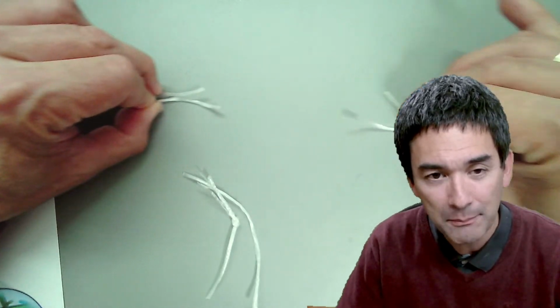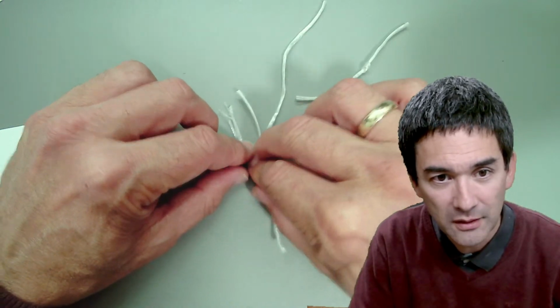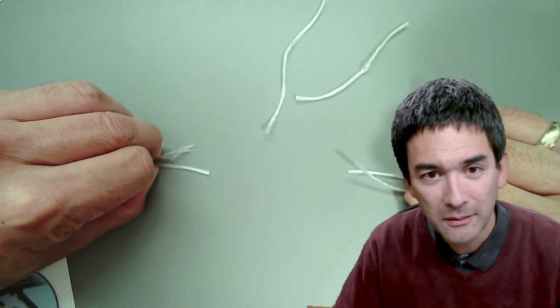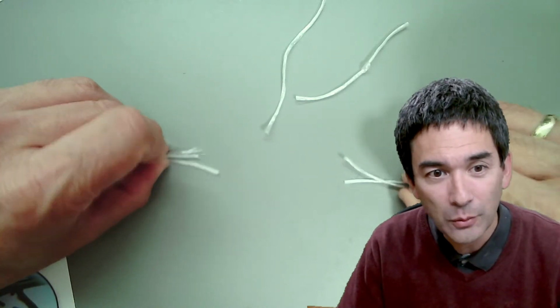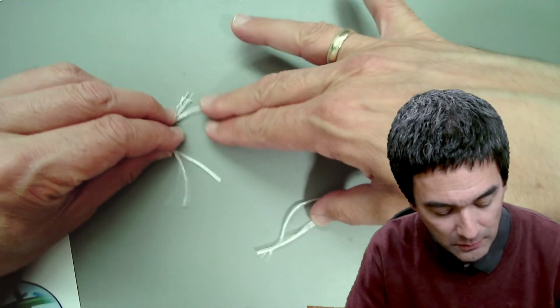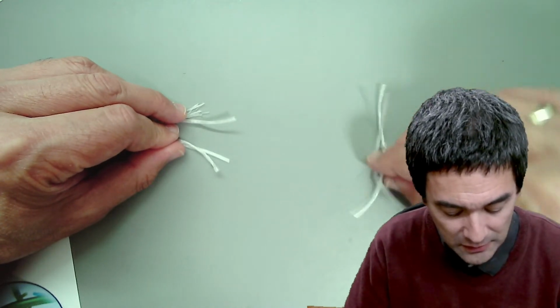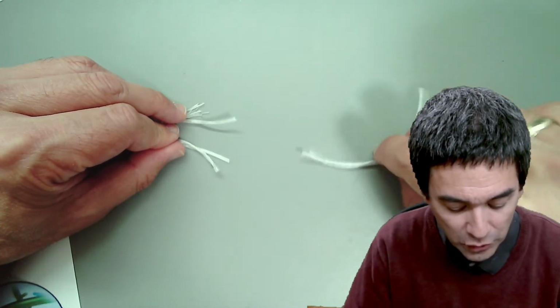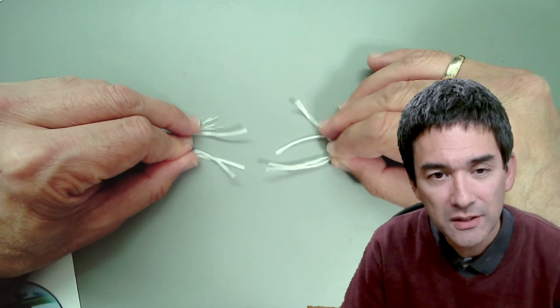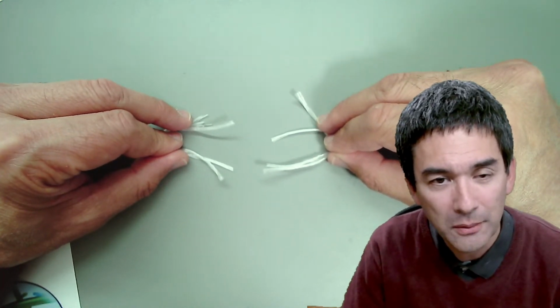And this doesn't only happen once, but of course also with all of the other chromosomes. They're pulled apart and pulled to the poles of the cell. Then what we see at the end is that on one end it looks like this, and on the other pole of the cell, it looks like this. You see that the arms of the chromosomes are now pointing to the center. This is something that you're able to see under the microscope.